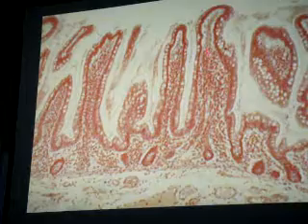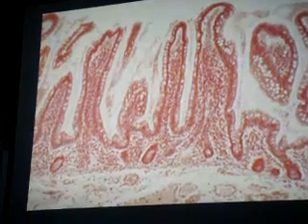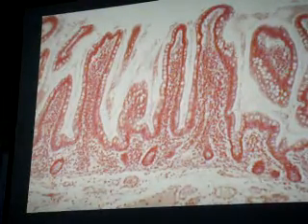Classify pointed tissue. Be specific. Loose or areolar connective tissue. So remember, in the lamina propria of your respiratory tract and GIT wall, the connective tissue underneath the epithelium is always a loose type of connective tissue.